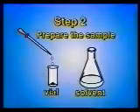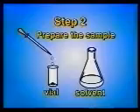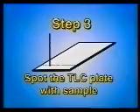In the second step, you prepare the sample. In order to perform a TLC analysis, it is necessary to introduce a very small quantity of your material onto a TLC plate before developing it. Make a solution of a small quantity of sample by dissolving it in the least polar solvent in which it is readily soluble. You are now ready for step 3.